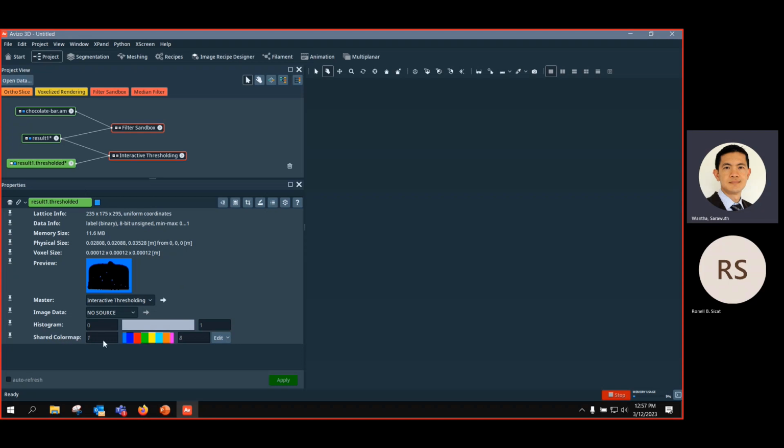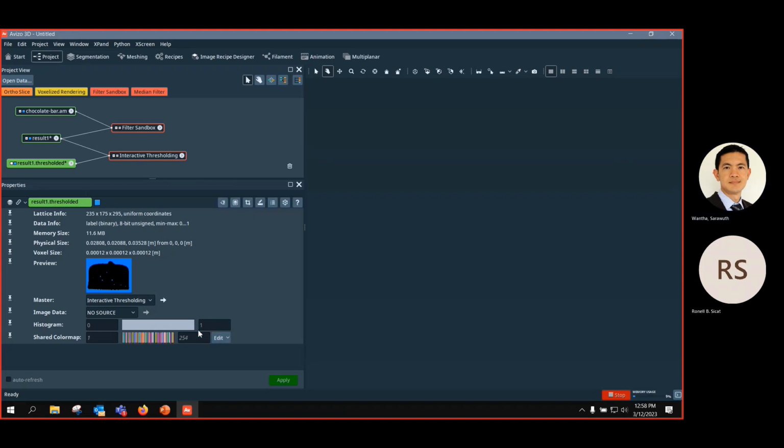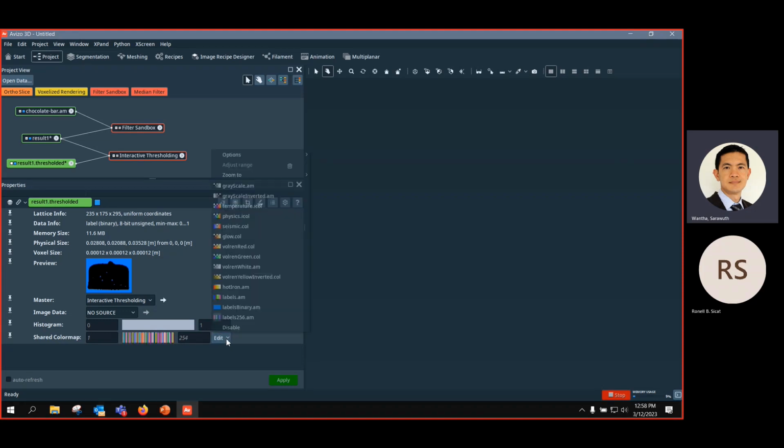And because we have this color map on the bottom here, an 8-color map, we start counting material numbers at material 1. For example, here light blue is 1. If you have 2 materials, material number 2 is going to be 2. And if you have 16-bit and something like 1,000 materials, the 8 colors get recycled. If you change to 256, the first material is hard to see, so you will not see it. That's why I start with the 8-bit.